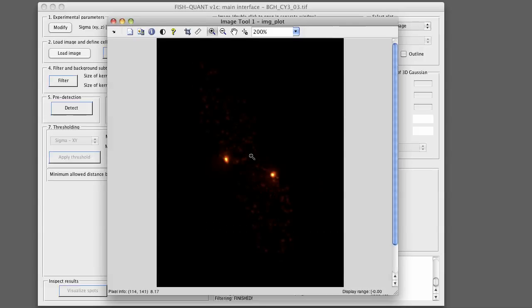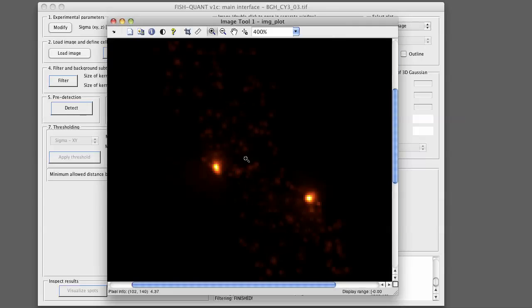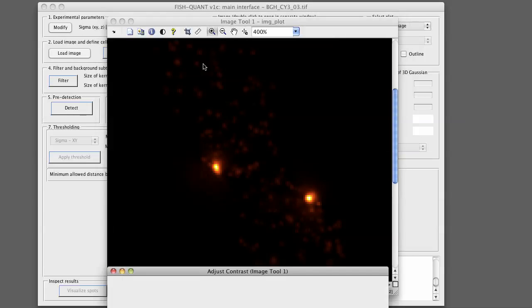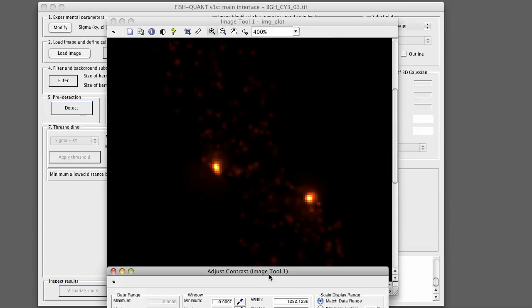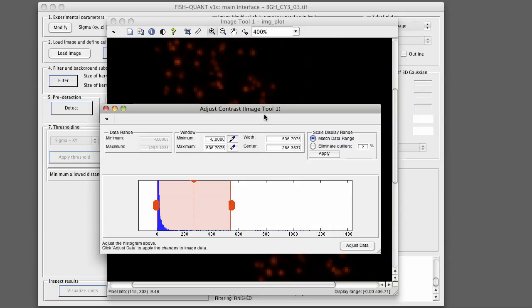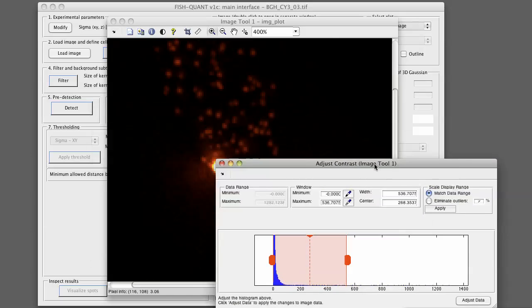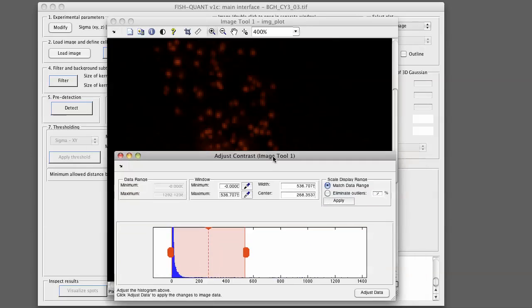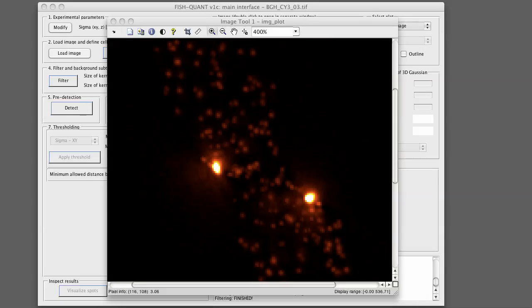You can zoom in and also change its contrast. We can do that in a way that we can really see nicely the individual molecules. If you move now with the cursor over the image, you see that down here you see an update of the position and also the intensity.